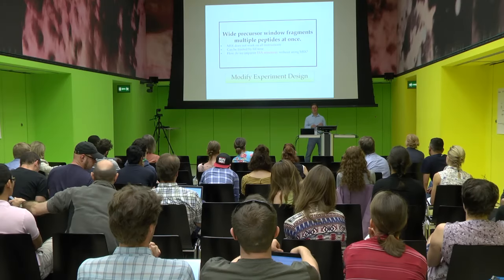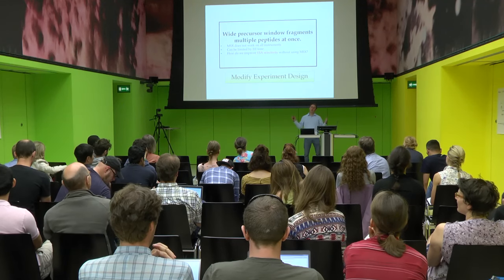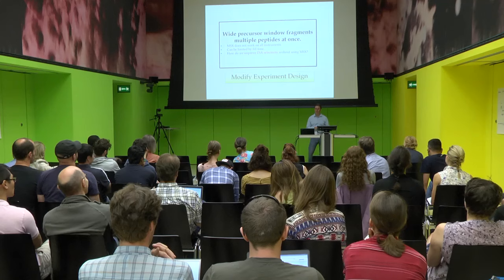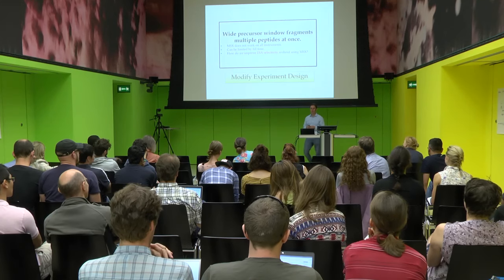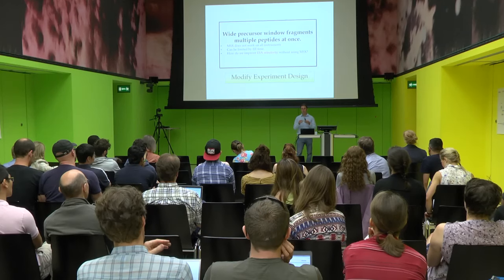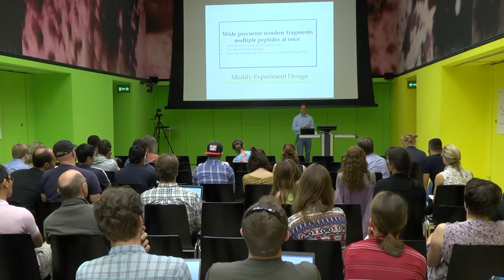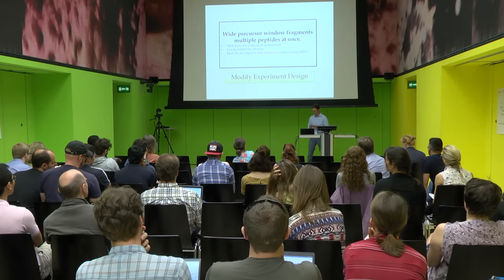And there's a lot of other fun instrumentation tweaks that you could think of. If I could build my own instrument, it would really solve the problem. I think you can also use, for example, time of flight separation. I think I saw a poster on how to do this. But of course, then you run into the duty cycle issues with TOF. But I can go on about that forever.